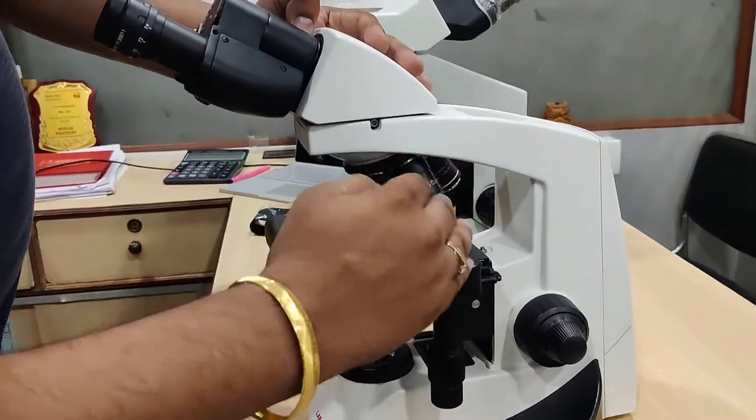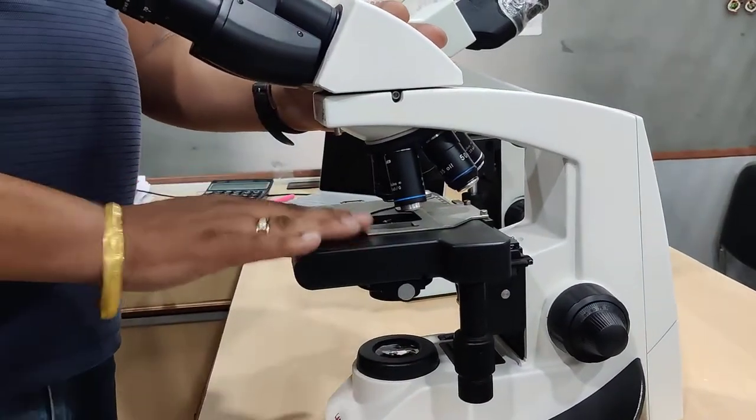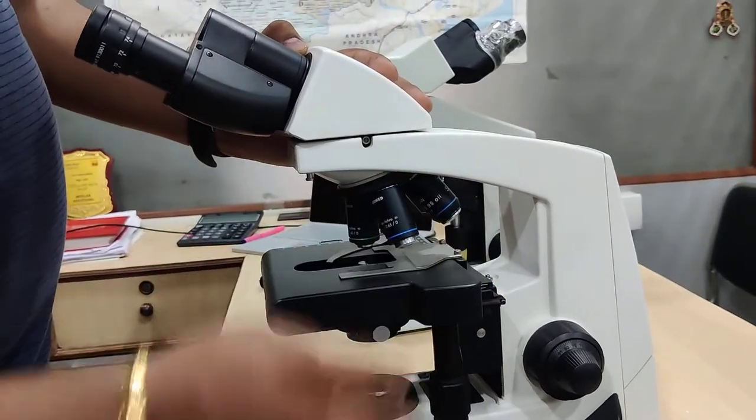As you can observe, the objectives are on the backward side. This gives you more visibility of the stage to see and place the slide.